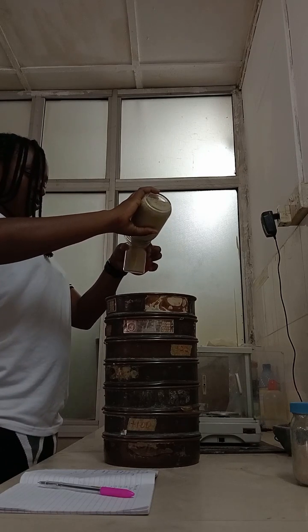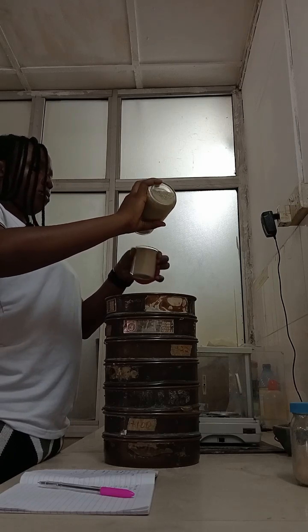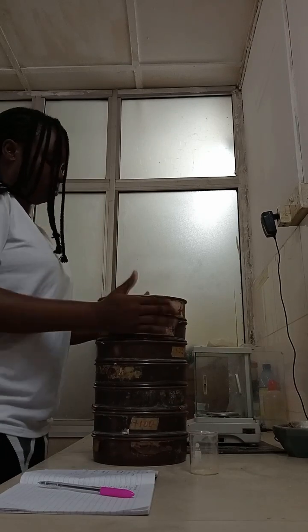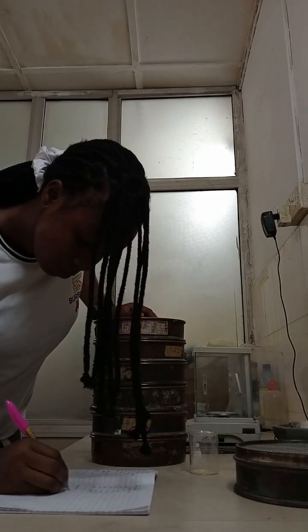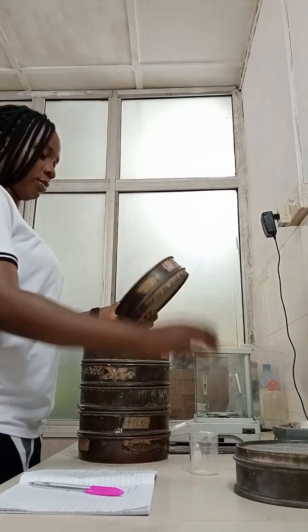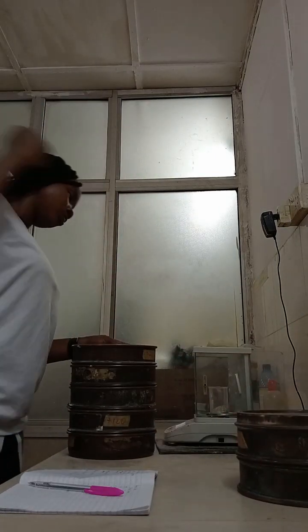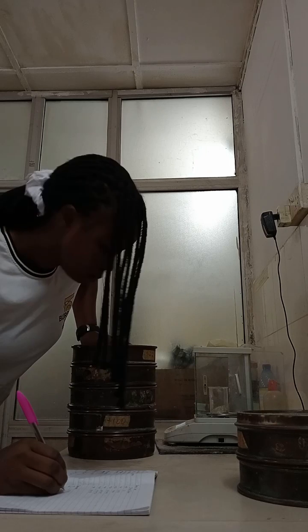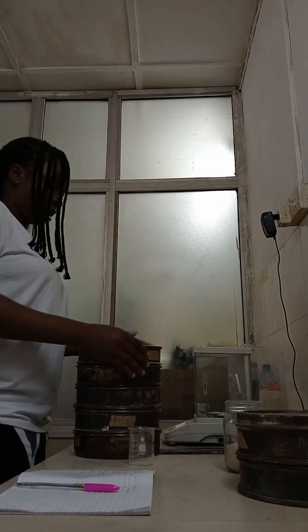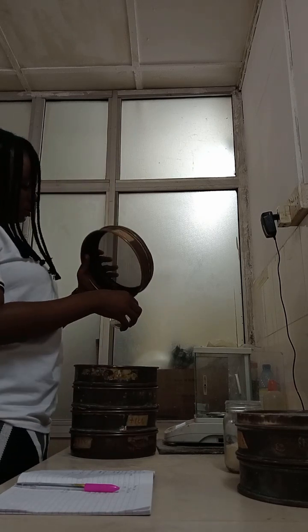This is the second sample used for glass. They use 7 raw materials for glass. This is called dolomite. It's not sand, it's dolomite. The same sieve test is performed on dolomite, and we also perform chemical analysis to check for the calcium oxide and the magnesium oxide. You have to record it, you have to go and show your boss. If it meets the specification, they have to accept it from the particular supplier. So this is what we do.